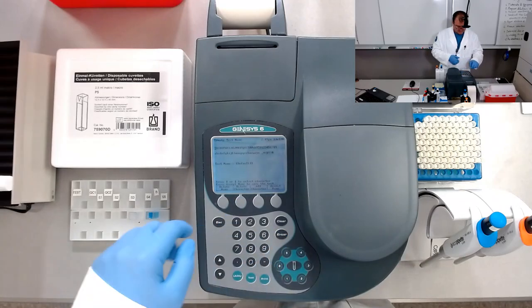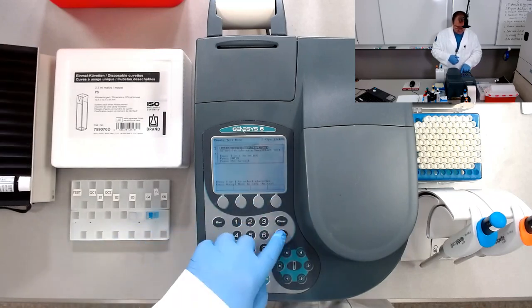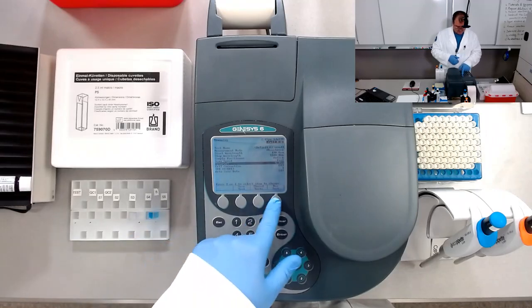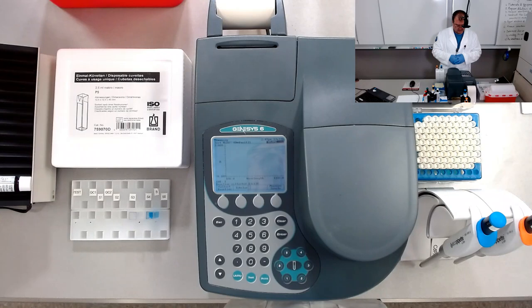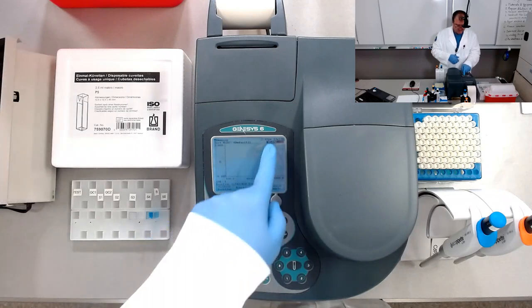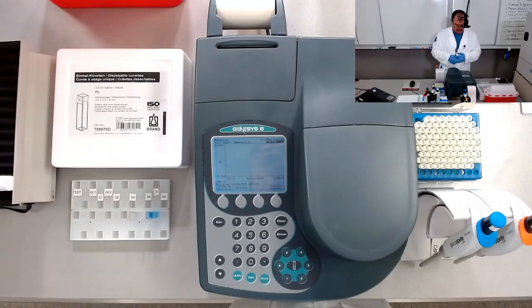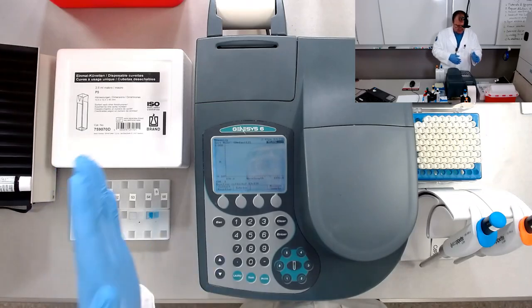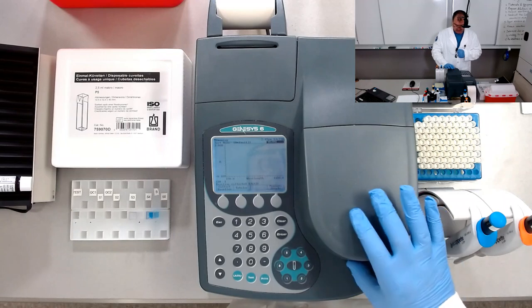Accept name. Okay, so we have one run test. We'll go run test. It now requires us to collect the baseline, meaning that we'll get the blanking for the whole range of wavelengths from 190 to 1100 nanometers. So it requires the blank.